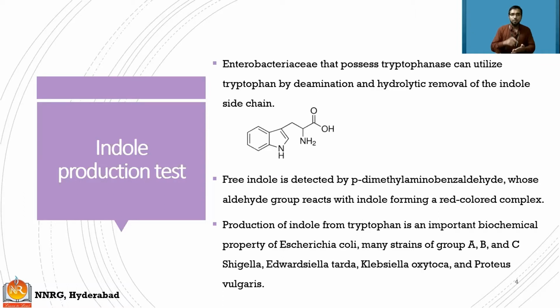So there is some specificity for every enzyme, right? Similarly, for tryptophan to be consumed, it needs an enzyme called tryptophanase. If it is a histidine amino acid, for it to be consumed, it needs an enzyme called histidase. In this case, the Enterobacter species will be consuming tryptophan and give out the indication.